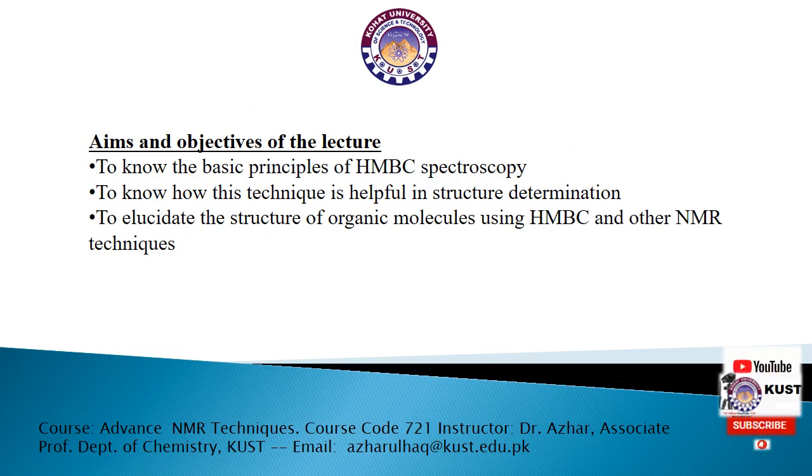Okay, aims and objective of the lecture. After having read this lecture, the student will be able to know the basic principle of HMBC spectroscopy, and they would be able to know how this technique is helpful in structural resolution of simple organic molecules, and to determine the structure of organic molecule using HMBC and other NMR techniques.